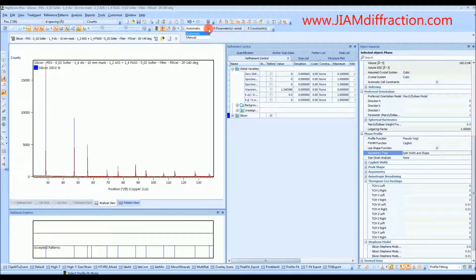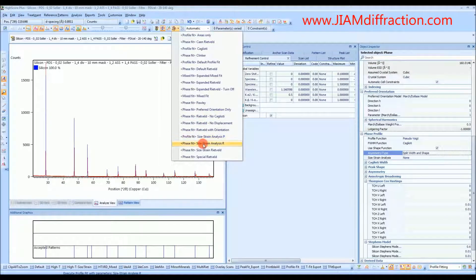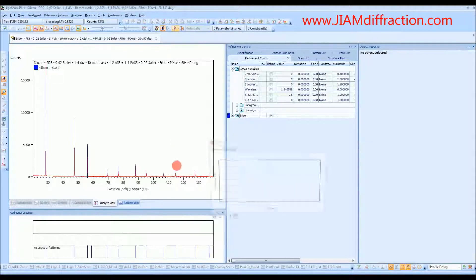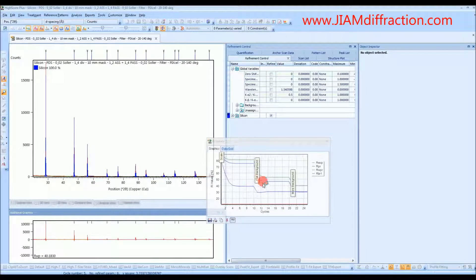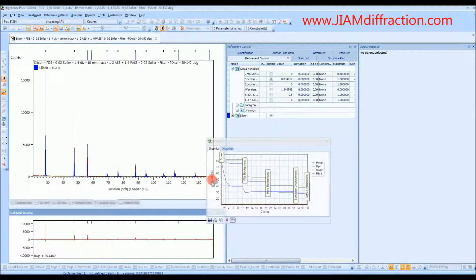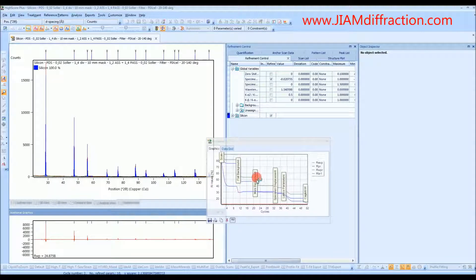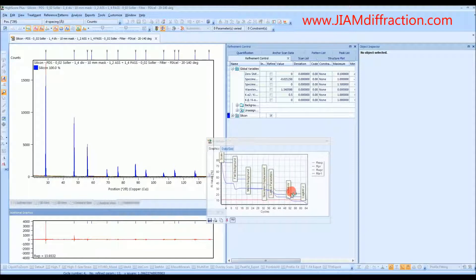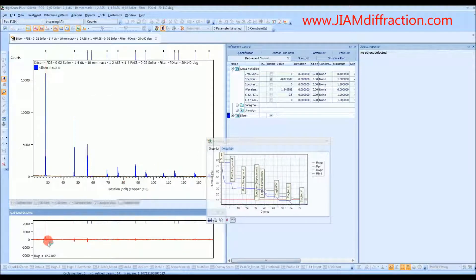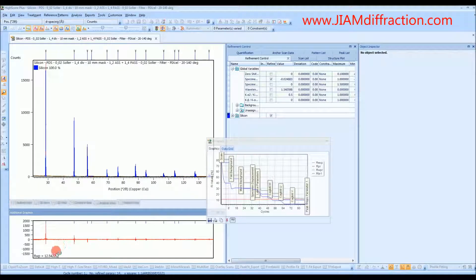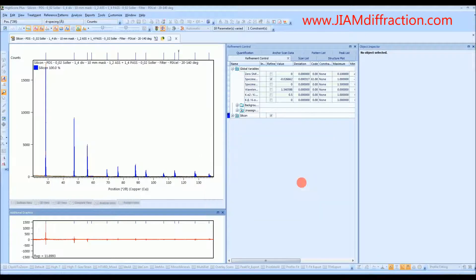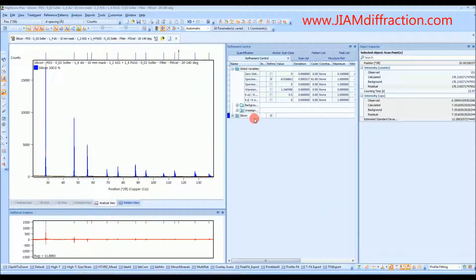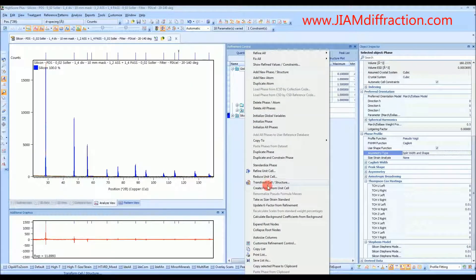All we do then is make sure that we are in automatic mode, and then go to this parameter set and choose size-strain analysis R — it's the phase fit. We'll click that, right-click down here to show the difference plot, and we see the refinement steps it's going through and how it's changing these R values, which are goodness-of-fit values essentially. We see that it modified some of the background terms, the lattice parameters, and the profile variables. This difference profile gets better and better, and the RWP continues to improve. Once we determine that we have a good fit, all we do is right-click on the phase and take it as the size-strain standard.